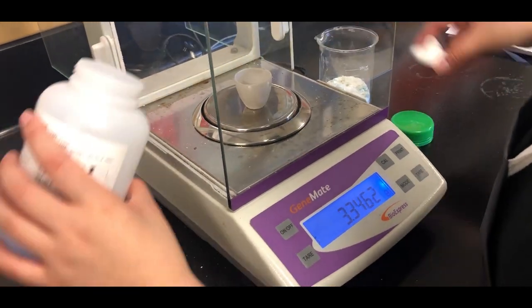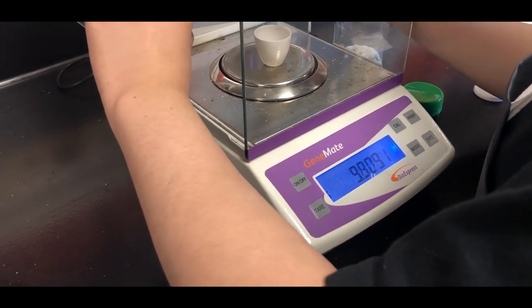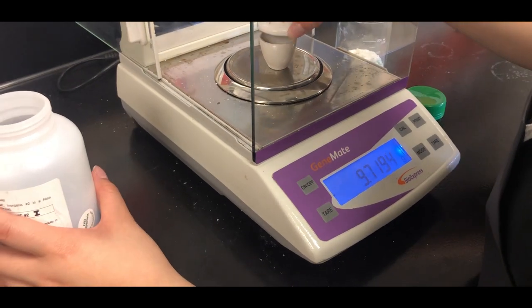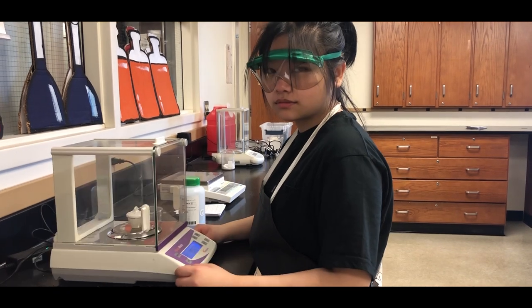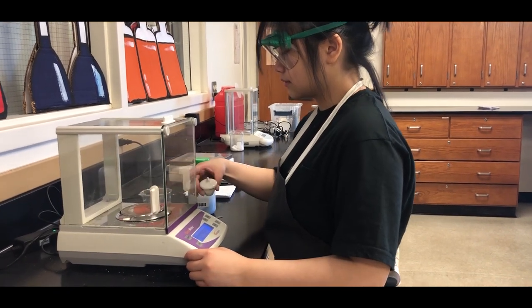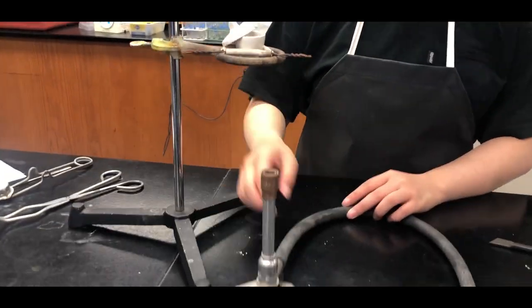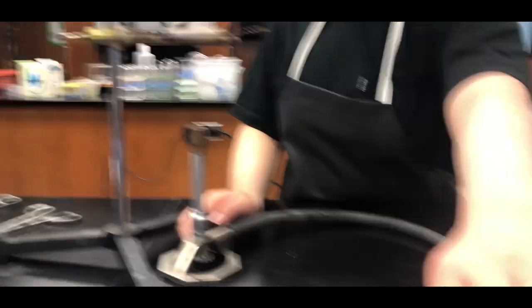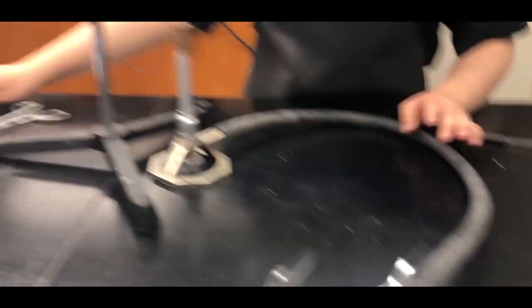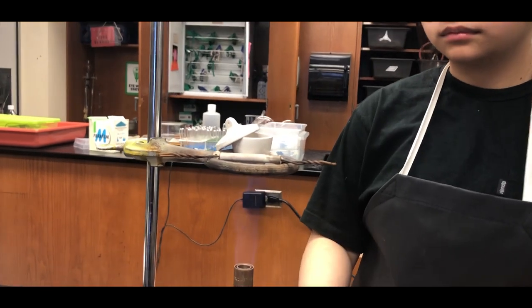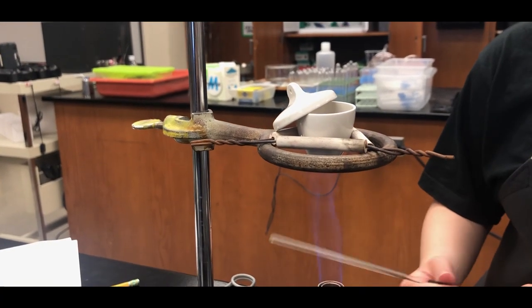Step 4 is to measure and record the total mass. Place the crucible on top of the clay triangle above the burner. Turn on the gas, light up the burner, make sure that the flame is blue. Make sure that the lid of the crucible is half open.